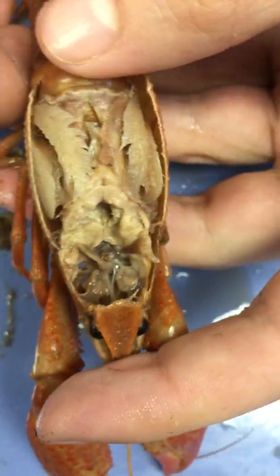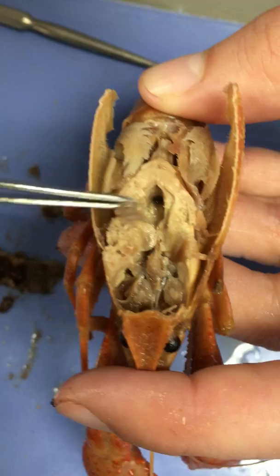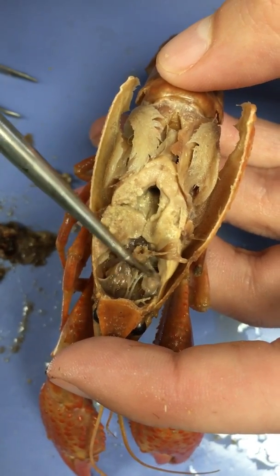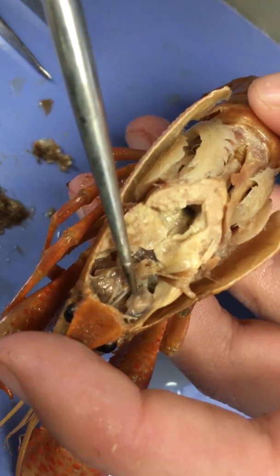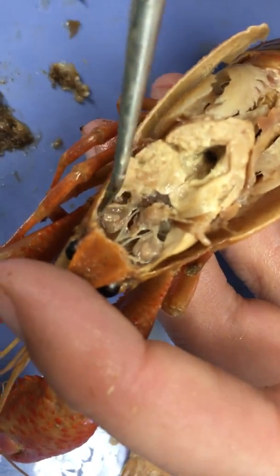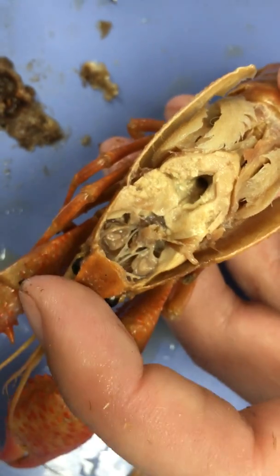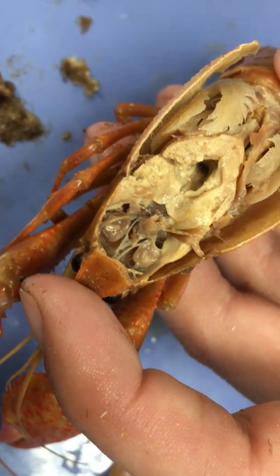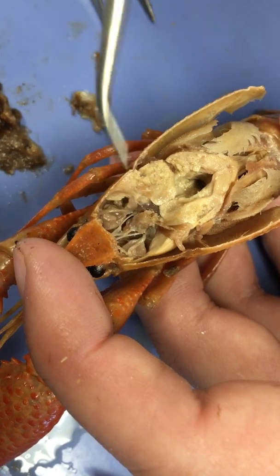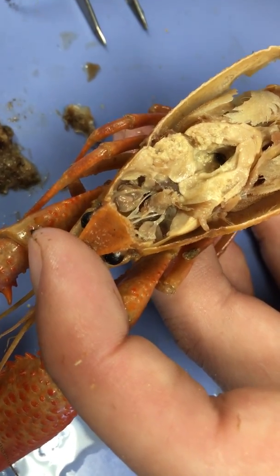Next, if we look inside the crawfish kind of behind the head, we can see some other important structures. The first are these two paired lobes — here's one, and the other is located just on the other side, reflected. These are called antennal glands, named because they're located just behind the antenna. The antennal glands don't really function the way the antennae do — instead, these are basically the crawfish's kidneys; they are osmoregulatory organs located just behind the antenna inside the head.